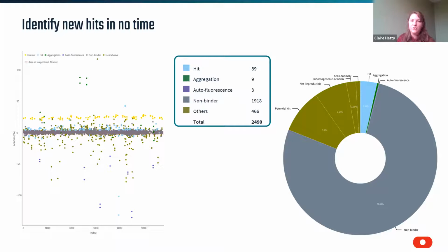Again, as a positive control, we use the SAM, and you can see this in the yellow. Throughout the screen, we make sure that there are positive controls scattered throughout to make sure that the target is still responding to its ligand, still functioning correctly, and still stable over the whole measurement time, so that this positive control interaction looks the same at the end as it did at the beginning. And also, to reference things throughout the experiment, we scatter reference measurements, which is just in the DMSO.